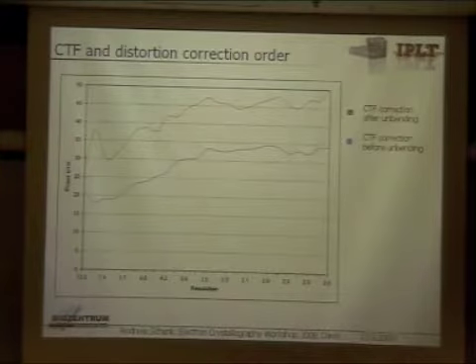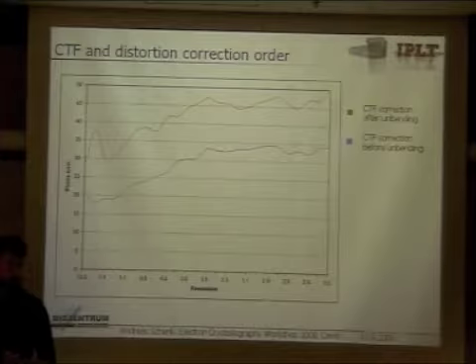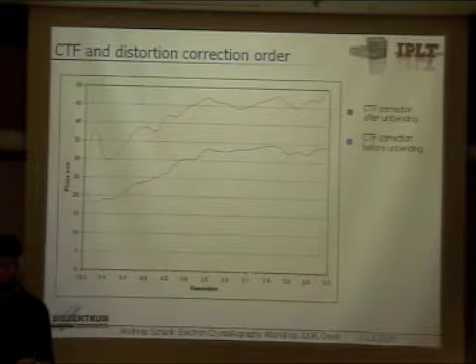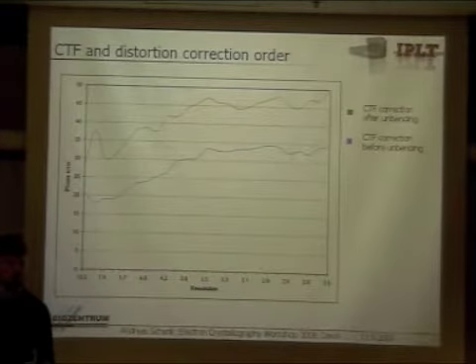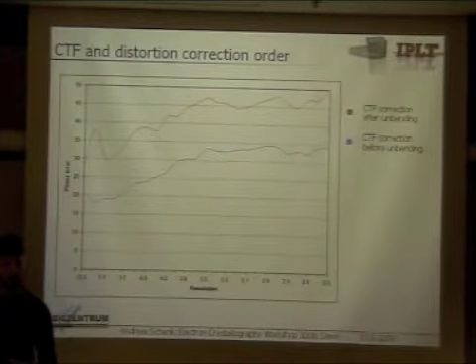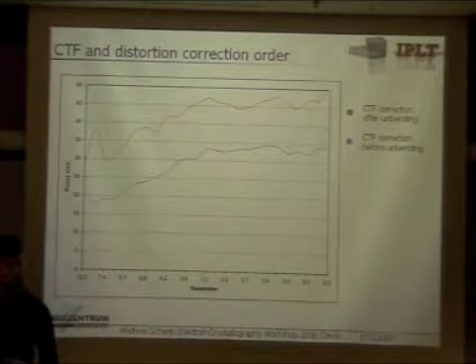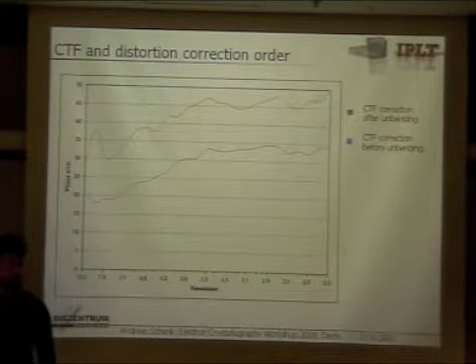Andreas, one other thing: it looks like your unit cells are well separated. The asymmetric unit, and therefore the PSF, the most important part, is localized and not really interfering with the neighboring ones. So making a simulated crystal that actually has crystal contacts would be worthwhile. Yeah, probably then the effect would be worse.